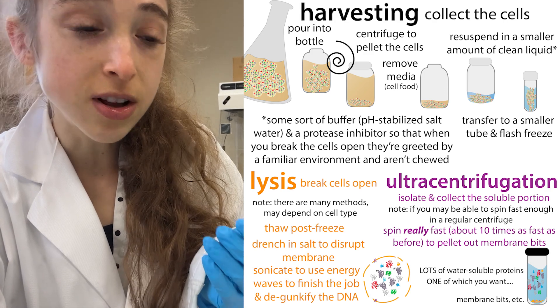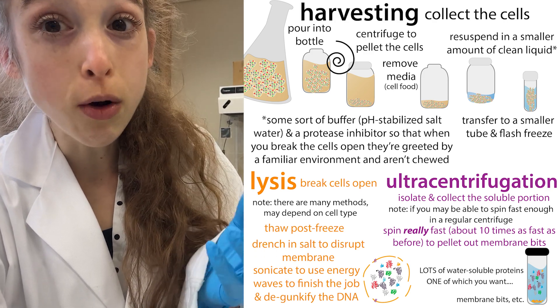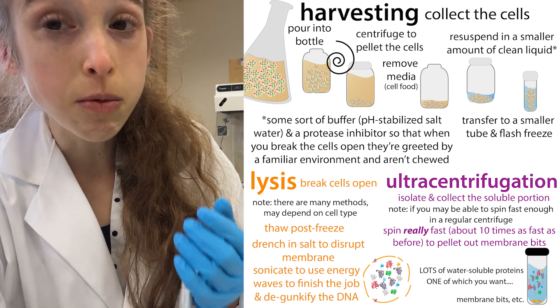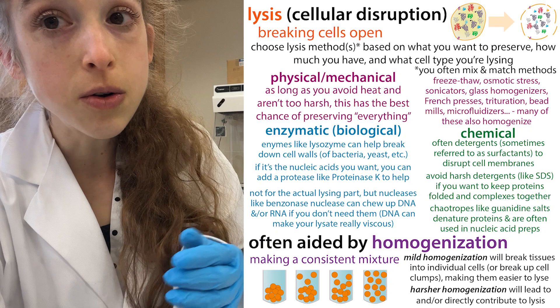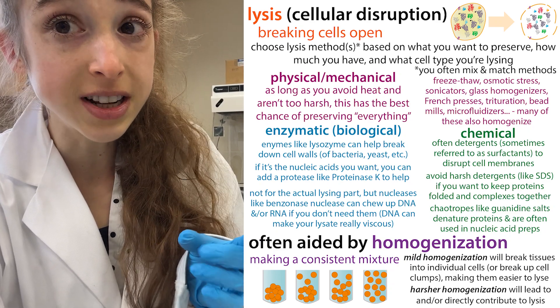This is a problem because the point of lysis is to break cells open so we can purify the proteins out of them. If the cells don't break open well, the protein is still going to be trapped inside the cell. When you take that liquid supernatant to try to purify protein, there's not going to be very much in it.